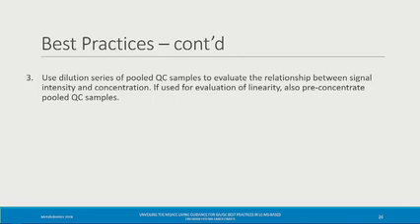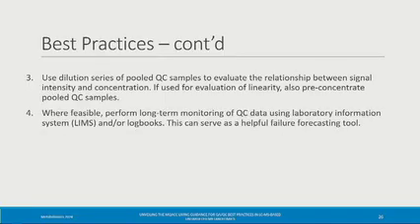The third best practice is the use of the dilution series of pool QC samples to evaluate the relationship between signal intensity and concentration. If used for evaluation of the linearity, also pre-concentrate the pool QC samples. The fourth best practice is, where feasible, perform long-term monitoring of the quality control data using laboratory information systems, LIMS, and or logbooks.